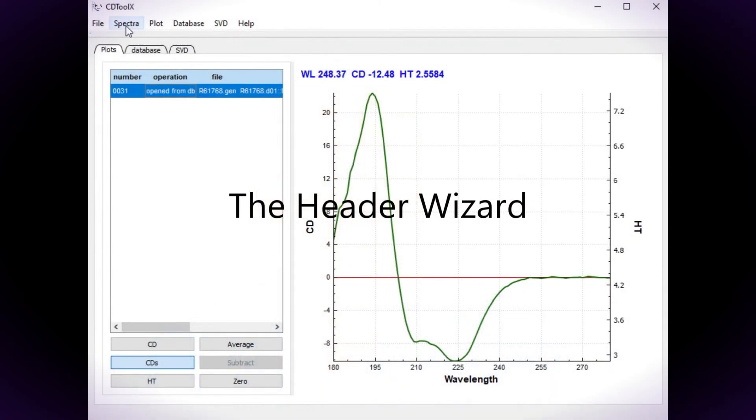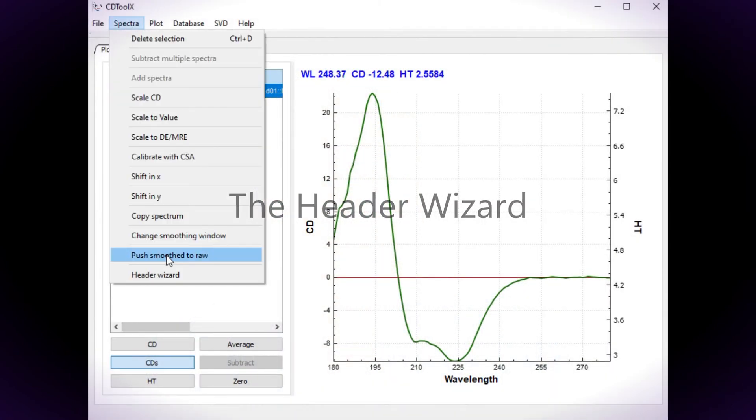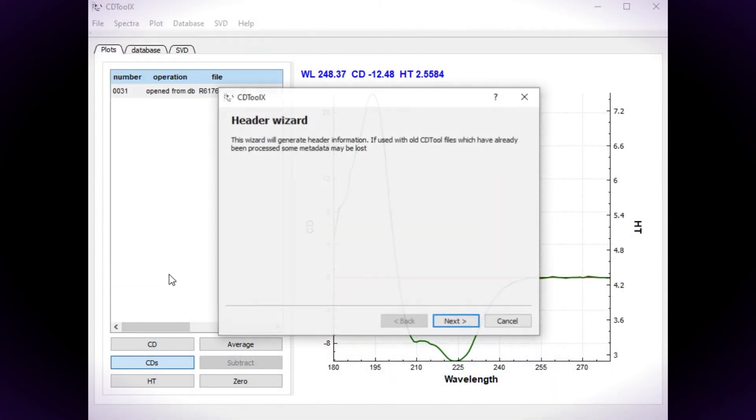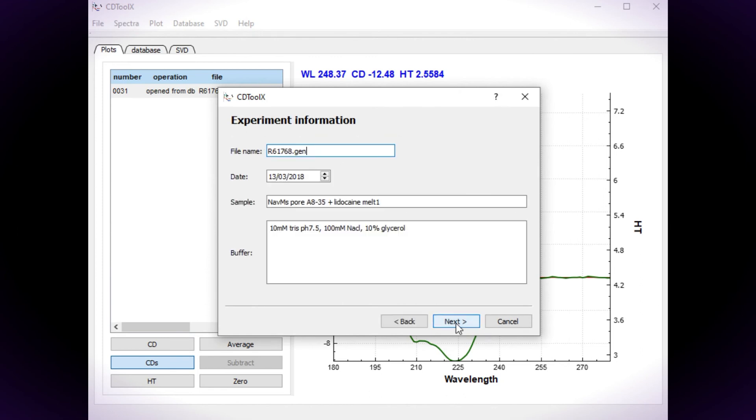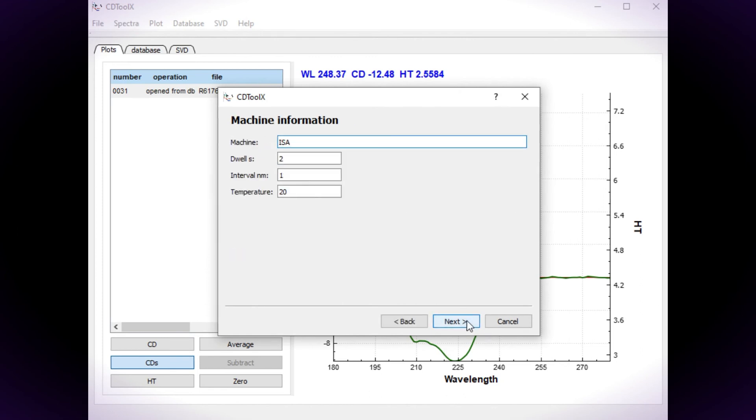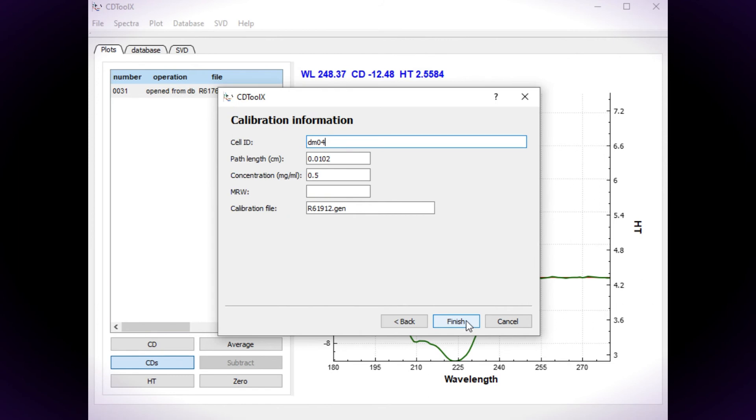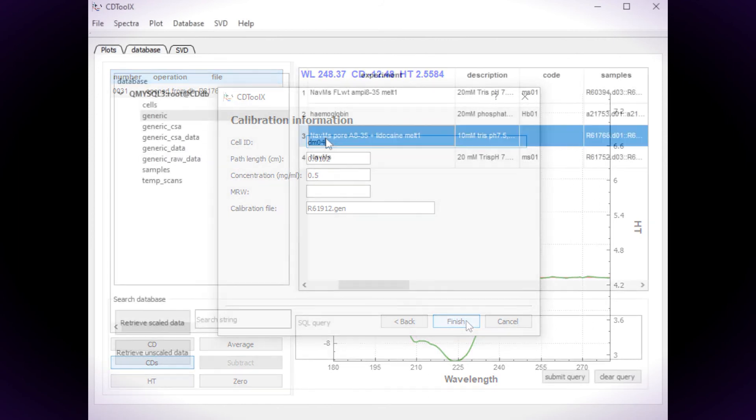Select the file, choose Wizard from the spectrum menu, then add the data. Fields not updated via the wizard can be updated directly.